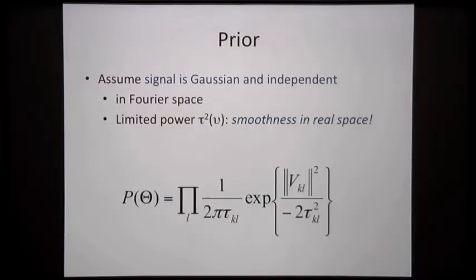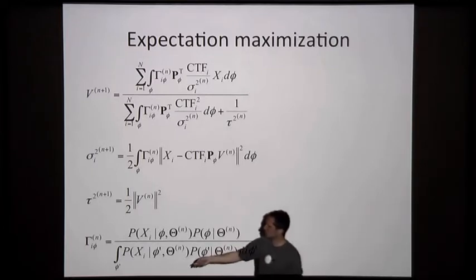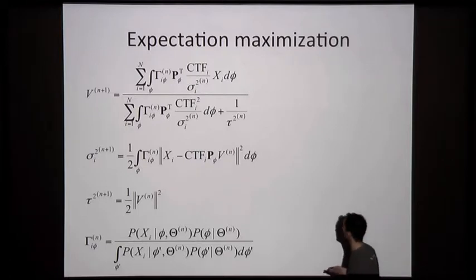So in one point in real space, if you move a bit to the left, right, up or down, then the changes in density will be relatively small compared to the density values, okay? And you can express that in mathematical terms, which we don't have time to go into detail to, okay? But you can now do similar things as we've done here, just setting derivatives to a target function to 0 and solve it. It becomes a bit more complicated.